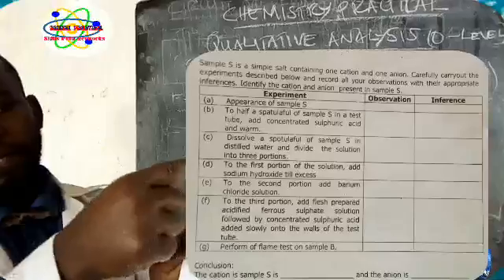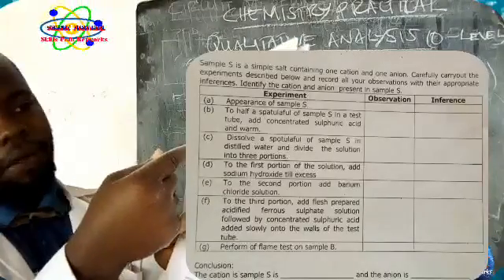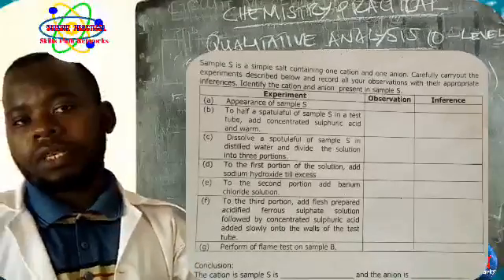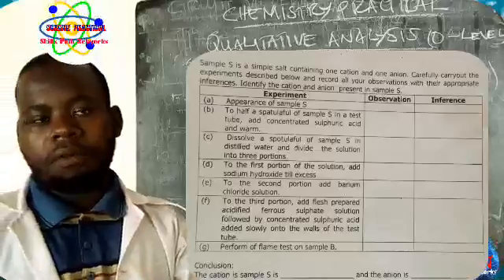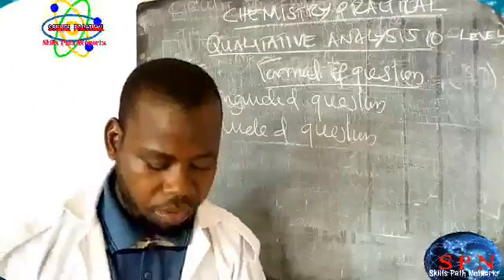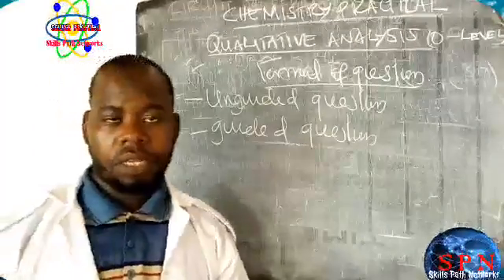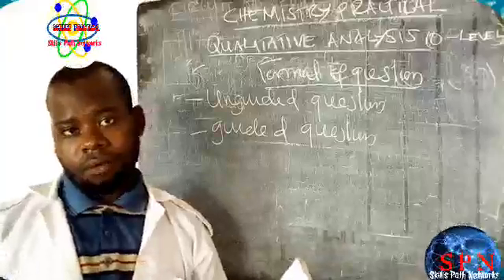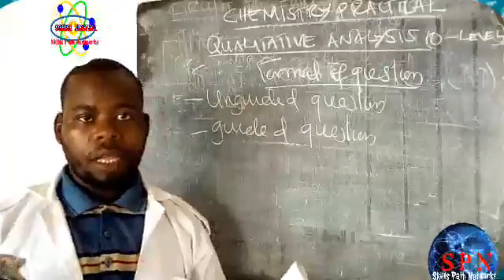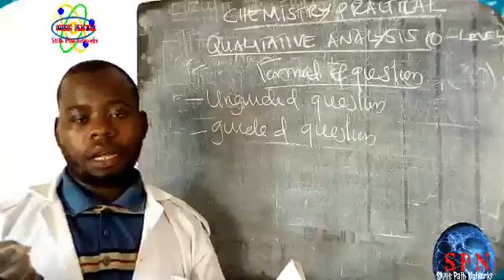So those are the questions. Then this is the format of our questions. Here we have some procedures: 1, 2, 3, 4, 5, 6, 7. But in our sheet there are many. So you can exclude the other procedures, then you perform the given procedures. But in which way do you perform this? It means in the examination you'll have a sample, a question paper, a guide sheet, and the answer sheet.